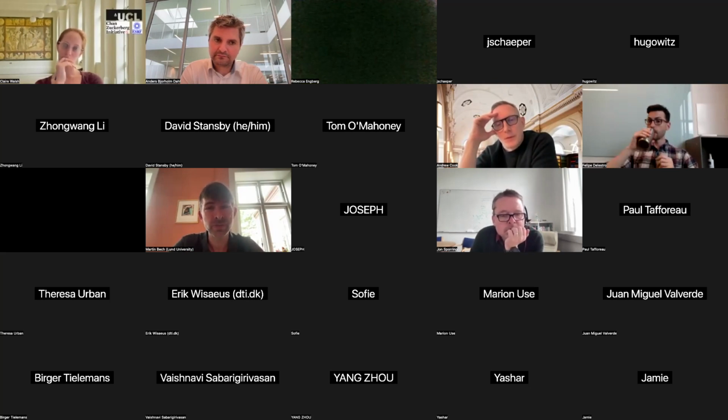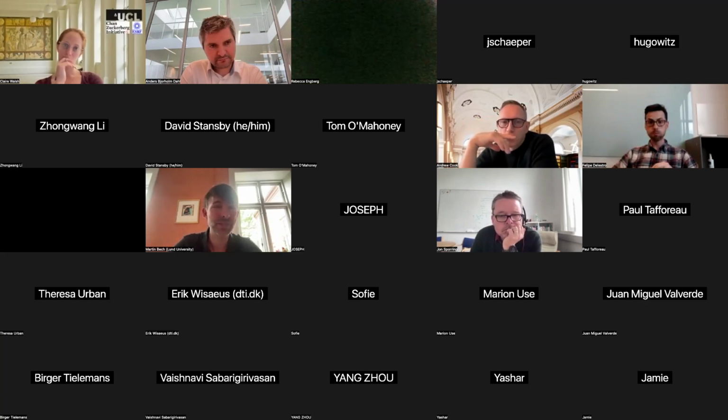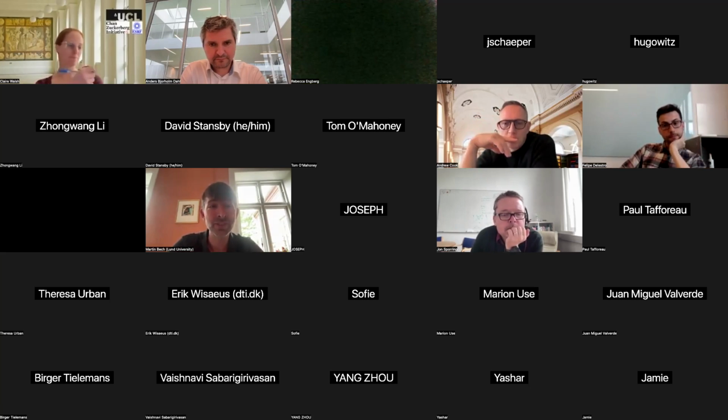Do you always get the same grayscale range, or how dependent is that on the exact embedding of that particular sample, if it's a different person doing it, or when you come back to the same beamline a few months later and you're doing the same experiment in principle, but things have changed a little bit? Can you compare the images, or what is your experience in this respect from the BMA team and the HOAHub?